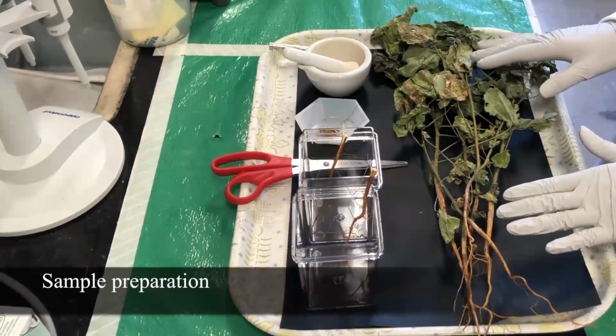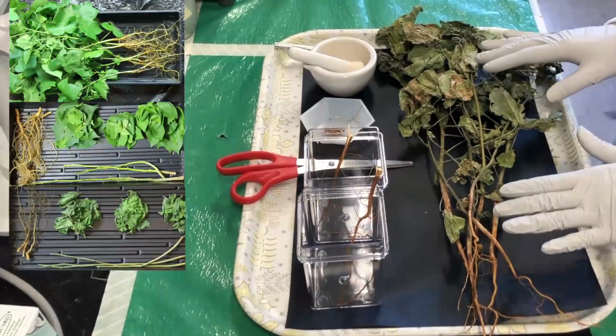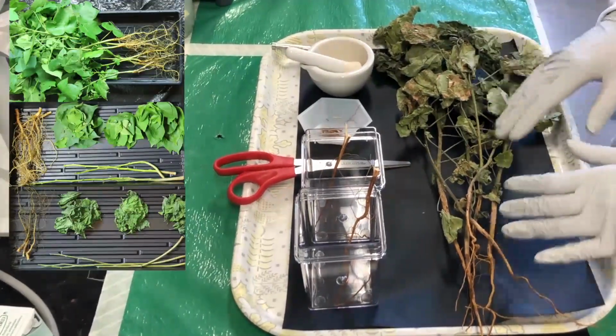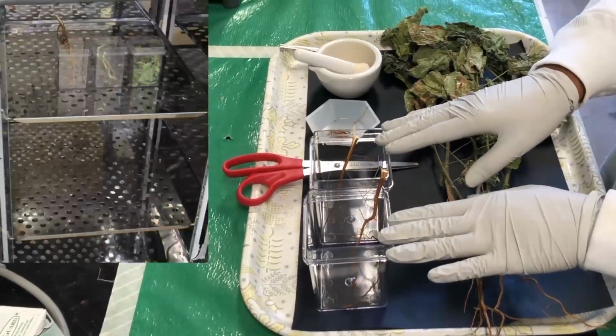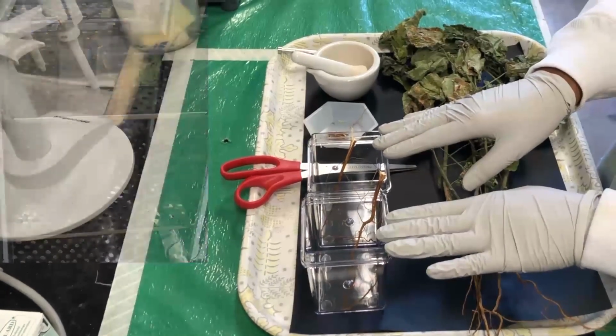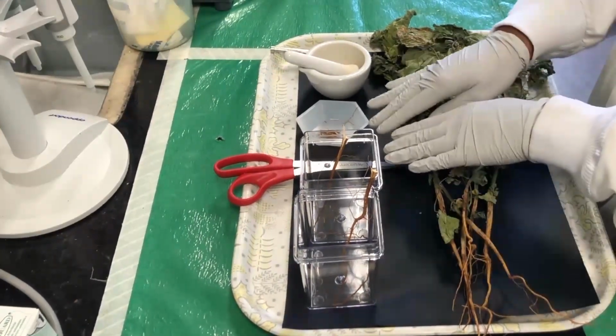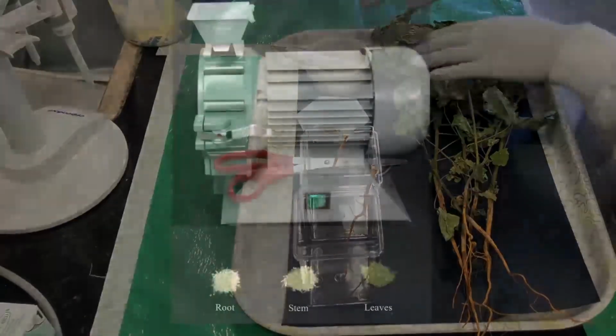Plant material is collected, the pots are flipped to separate the roots, washed thoroughly in water, air-dried for 2 days, transferred into labeled containers, and incubated in the incubator at 49 degrees centigrade for 1 week to 10 days. Using scissors, the tissue is further cut into 1 mm to 3 mm size pieces.